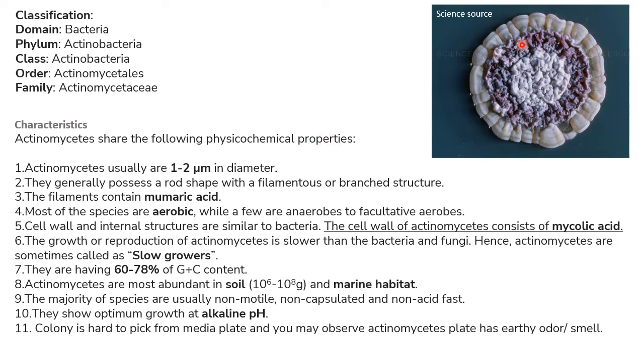So this is actually a colony of Streptomyces, and you can see how dull and dry it looks, and it is very tightly attached to the agar surface. Those white dots you can see actually reflect the light, and it is a way to point out that the colony is very hard to pick, as it is tightly attached to your agar surface. So you need to dig in a part of the colony to subculture.